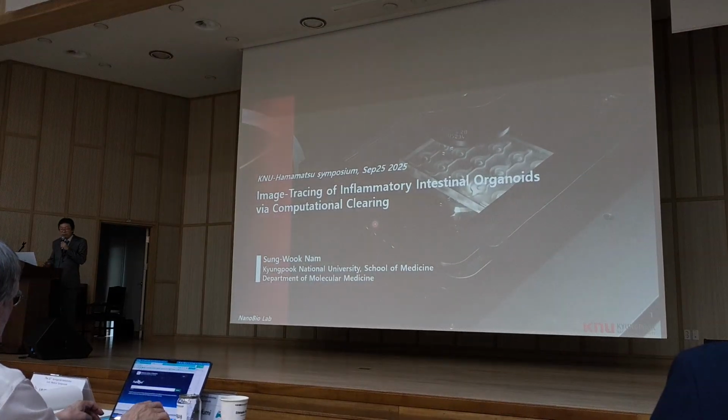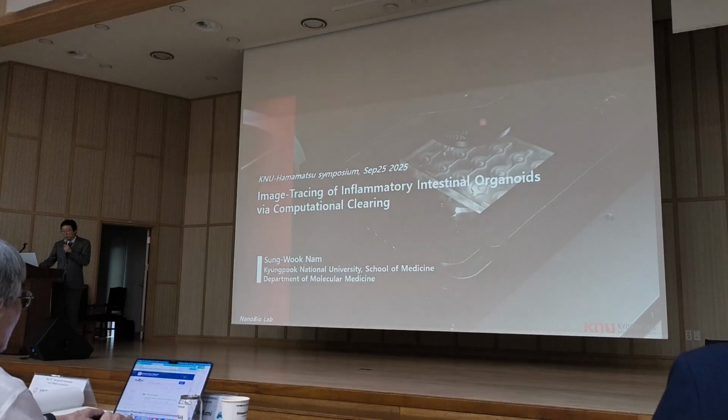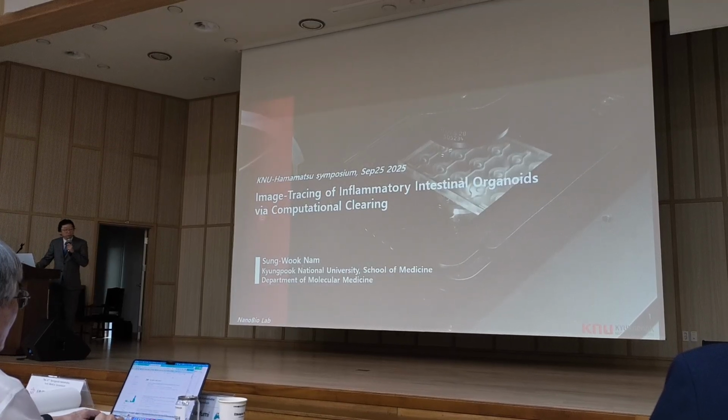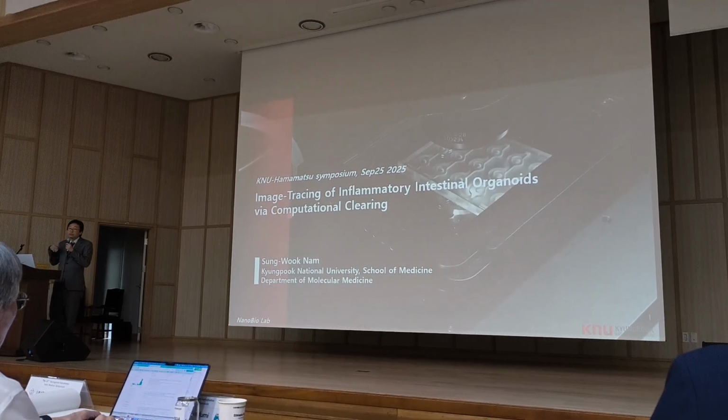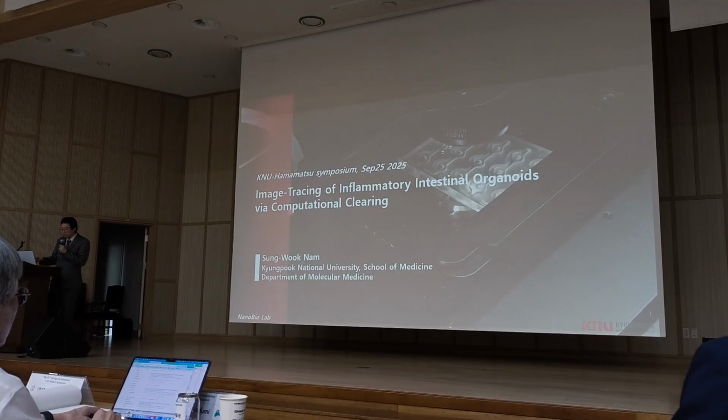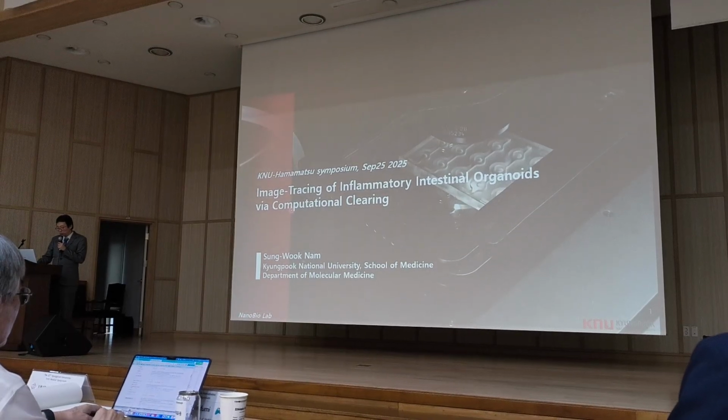So my talk is about image tracing of inflammatory intestinal organoid by using computational clearing, which is a kind of image processing algorithm. So I will introduce this one.